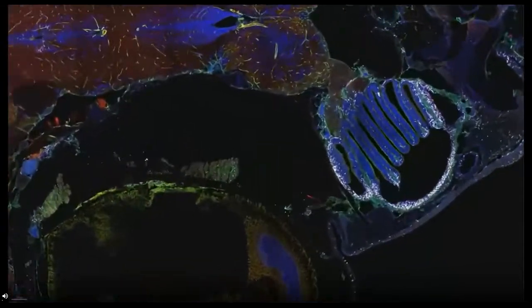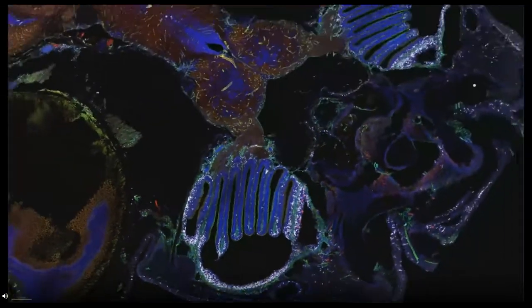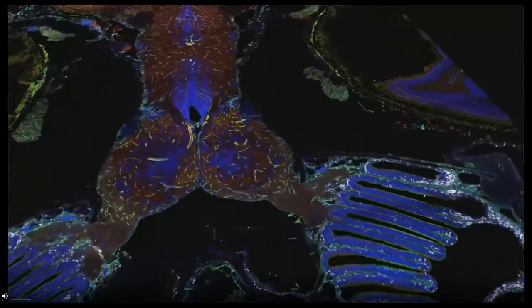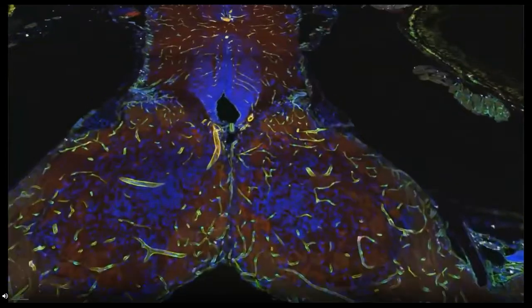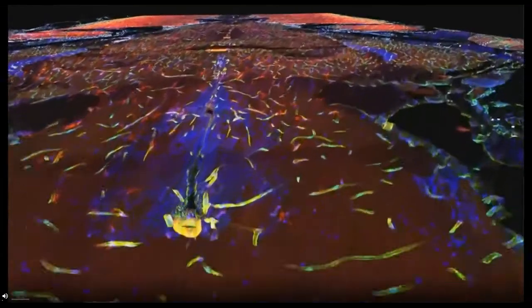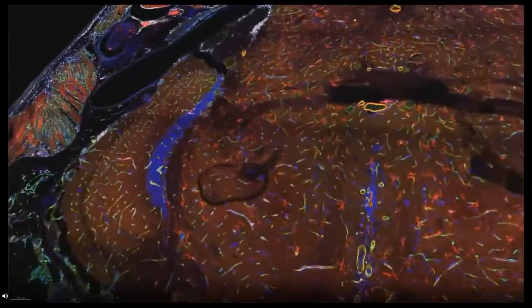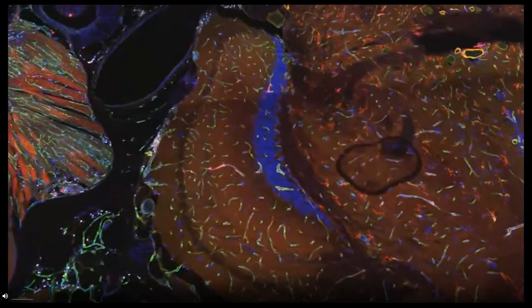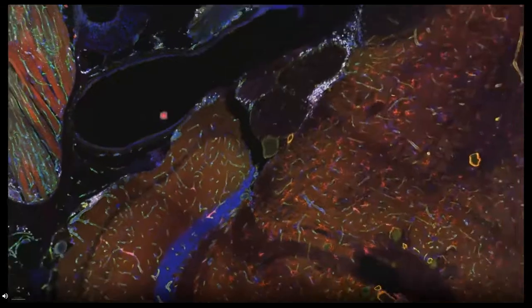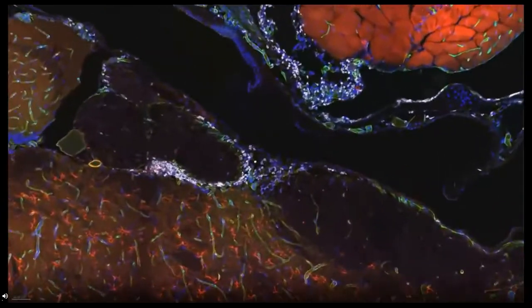So here we focus on the nostrils, and you can see all the T cells, individual cells. And then you can move around, go into the olfactory bulb. Yeah, there it is with Star Wars mode. Here you can continue, and then you can see the differences between the different regions of the brain. You can see all these red cells that you will not see in the forward regions. Then you have the optic tectum, where you see some T cells. In the meninges, this is the ear of the fish, again with a bit of T cells, some nerves.